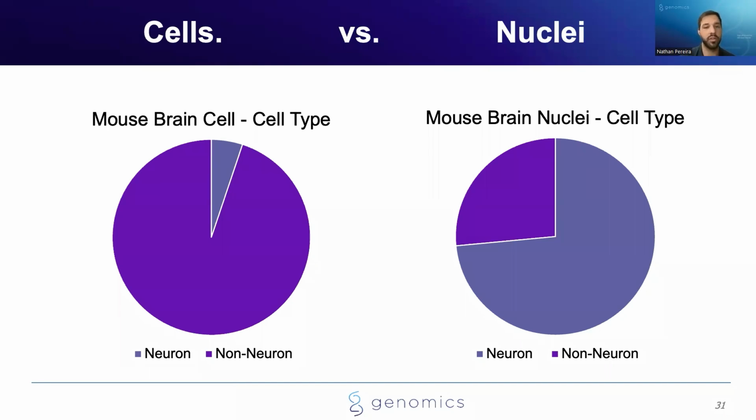And this is also a benefit of this nuclei isolation protocol, especially for brain, which is a 6-minute protocol. On the Singulator and most manual methods for brain, it's about 45 minutes to an hour before any sort of downstream cleanup. So all of these samples also went through a debris removal protocol, which I'll go over a bit later. But a full 30-minute protocol for nuclei from start to finish to loading, and about an hour and a half to 2 hours for a cell type isolation.